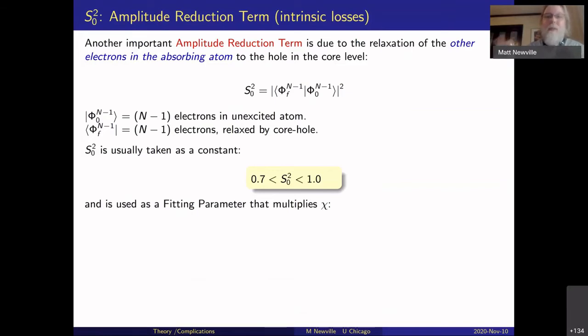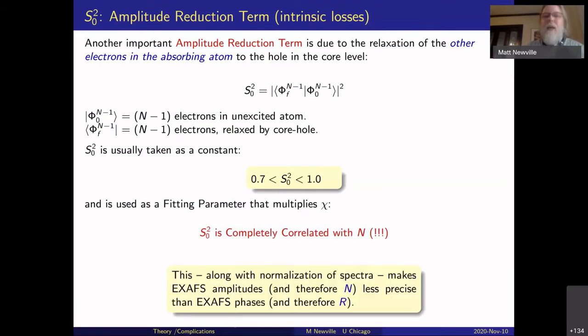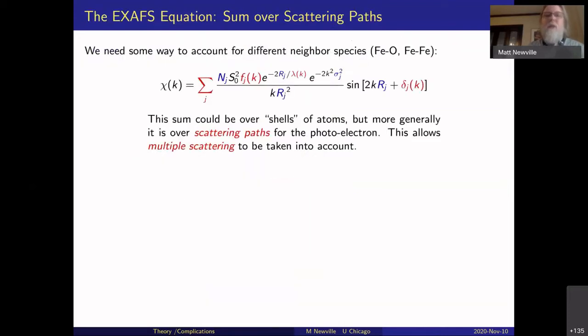The size of that spread, the energy resolution, will almost exactly impact either the mean free path value, or could be modeled by changing the mean free path value or changing S0 squared. And we typically just ignore those effects because there isn't much variation in real beamlines, but part of this effect is the change in resolution between beamlines.